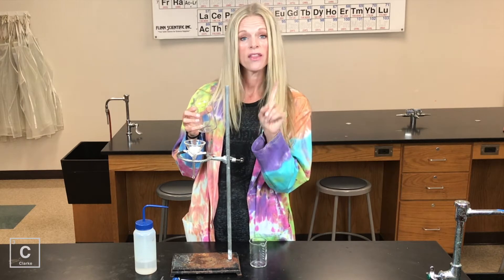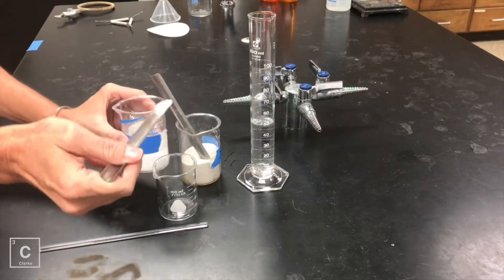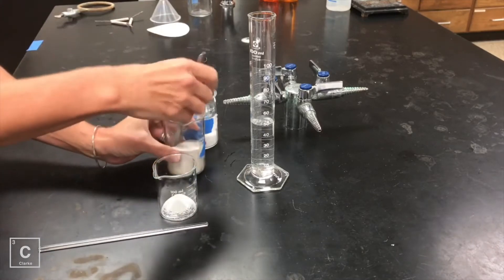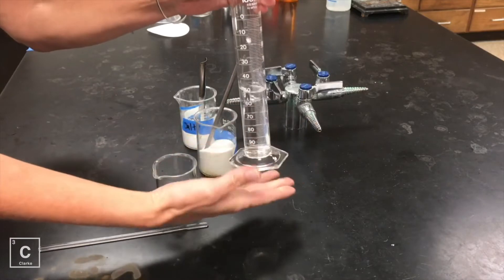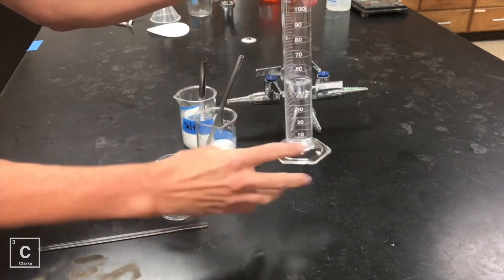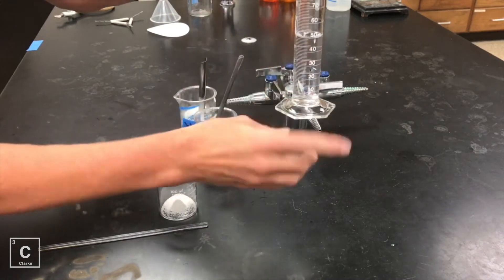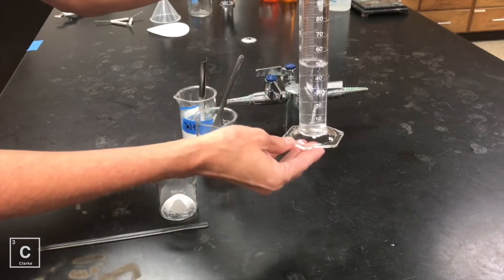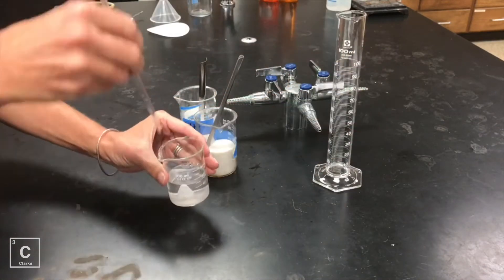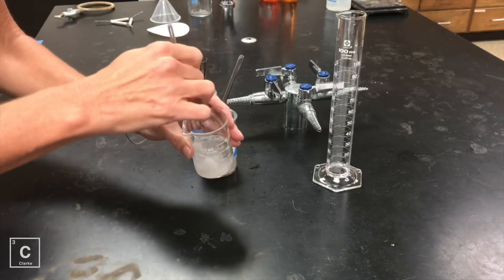Make sure you have something to write with, something to write on, and let's get started. I'm going to add just a spatula of salt and a spatula of sand. My graduated cylinder — notice this graduated cylinder is a different size. This is a 100 ml graduated cylinder; it goes from 0 to 100. I only needed 50. The bottom of the meniscus is on the 50. And then I'm going to stir my mixture.